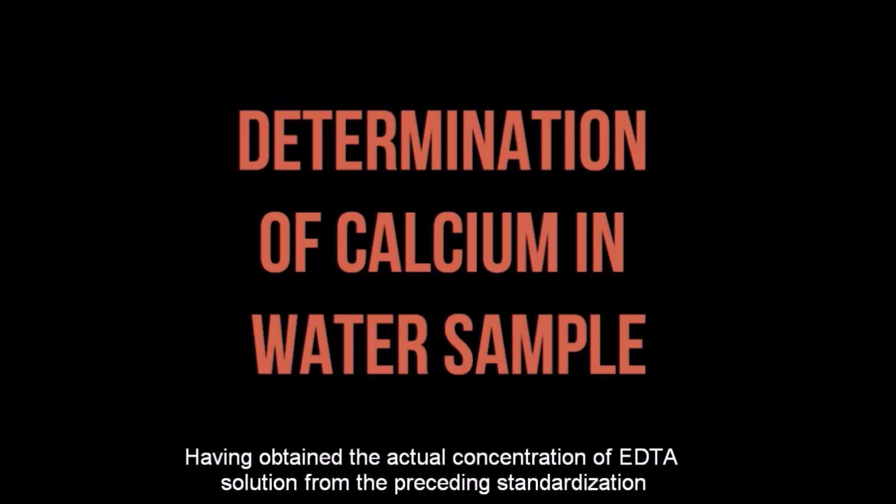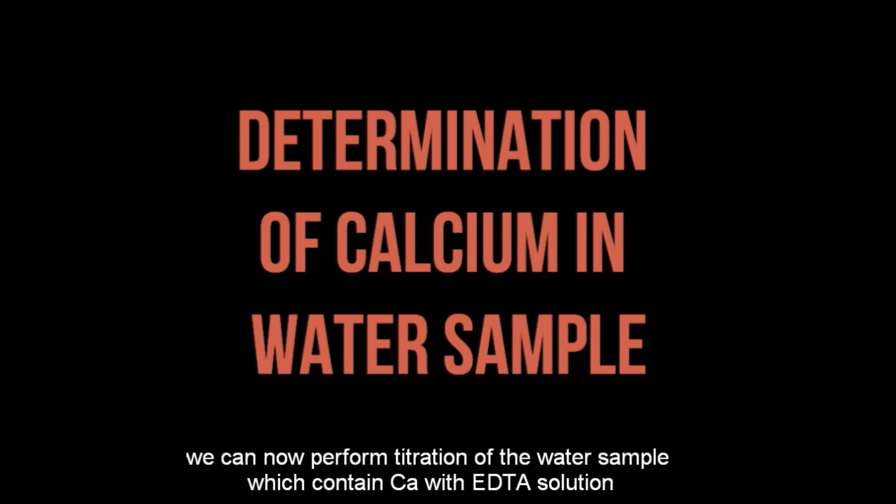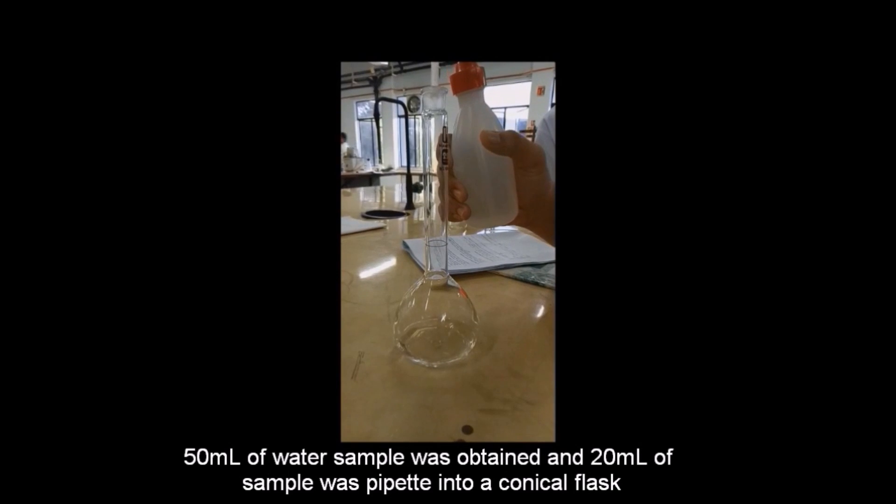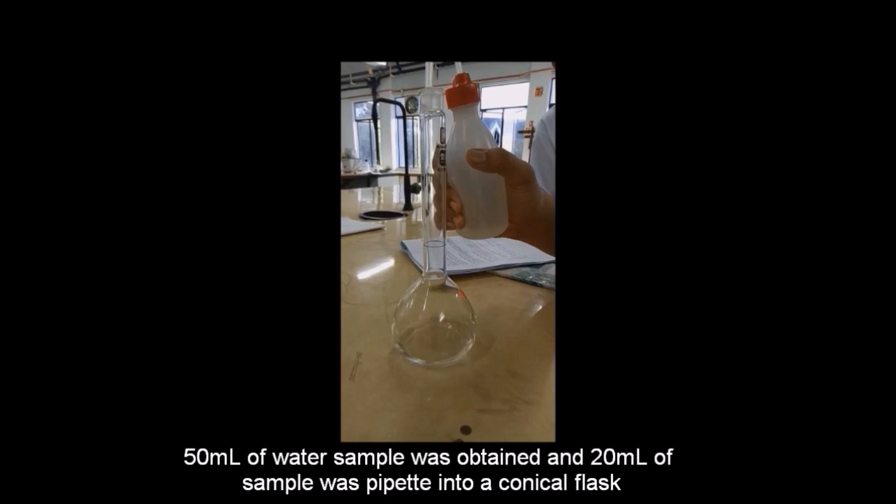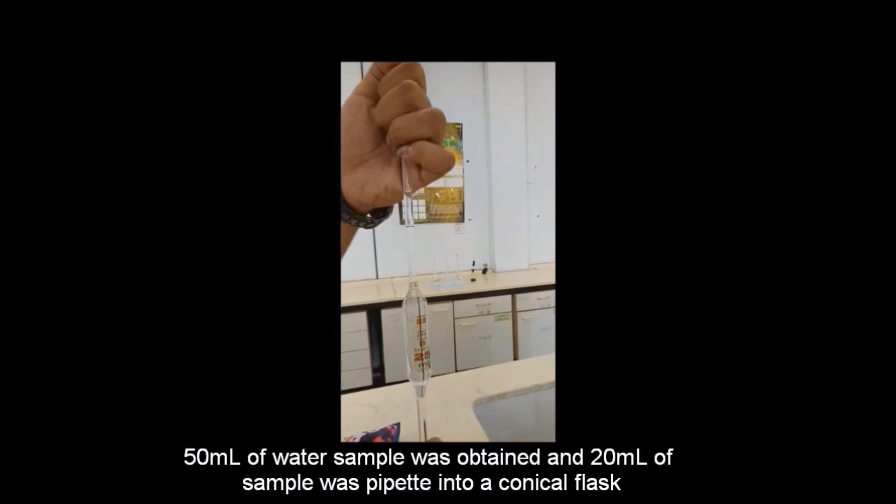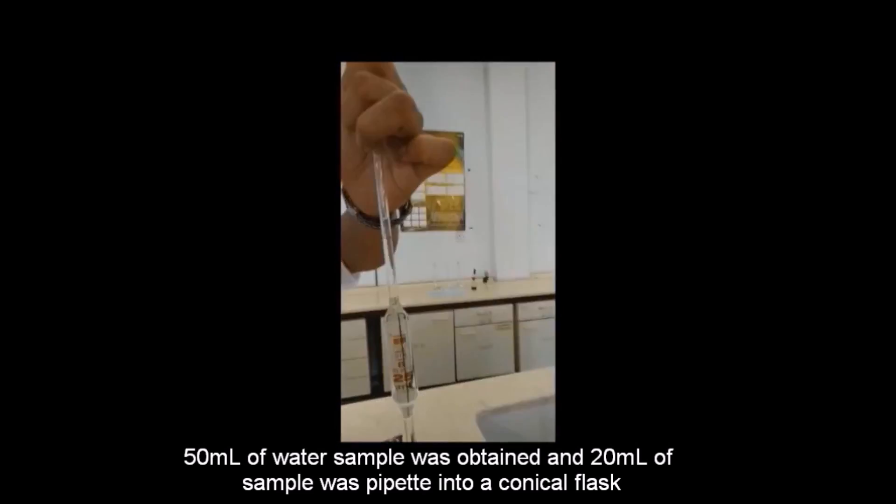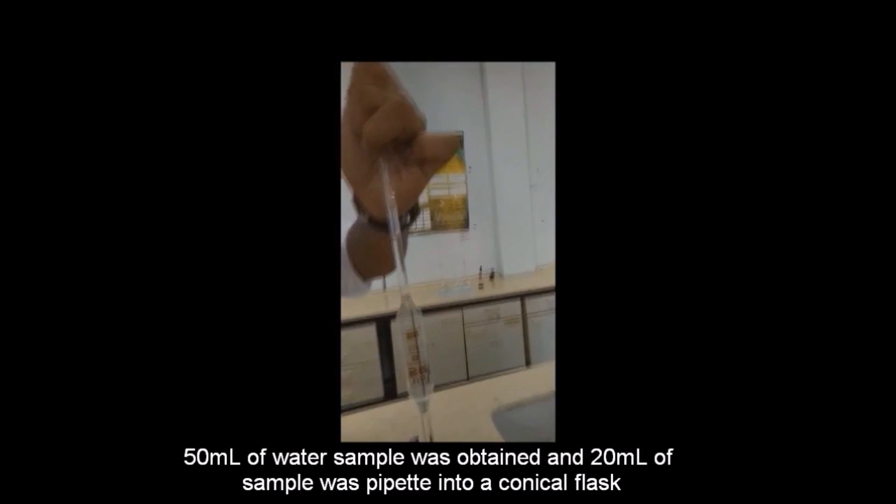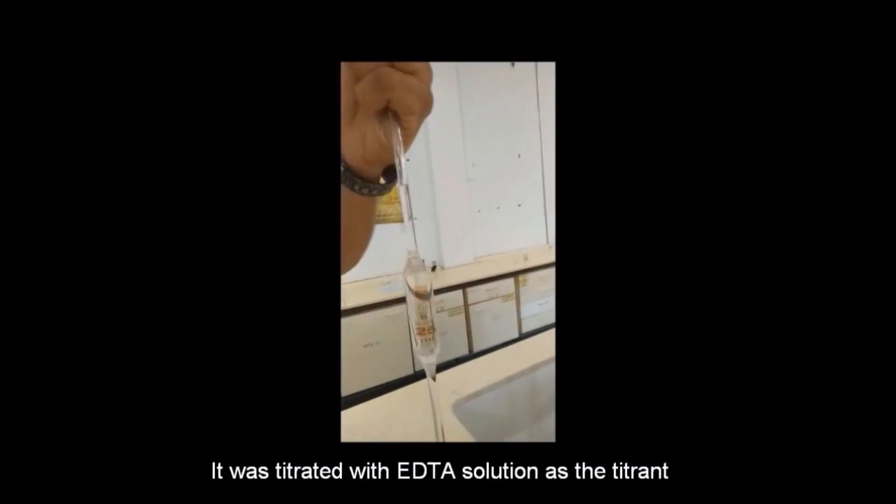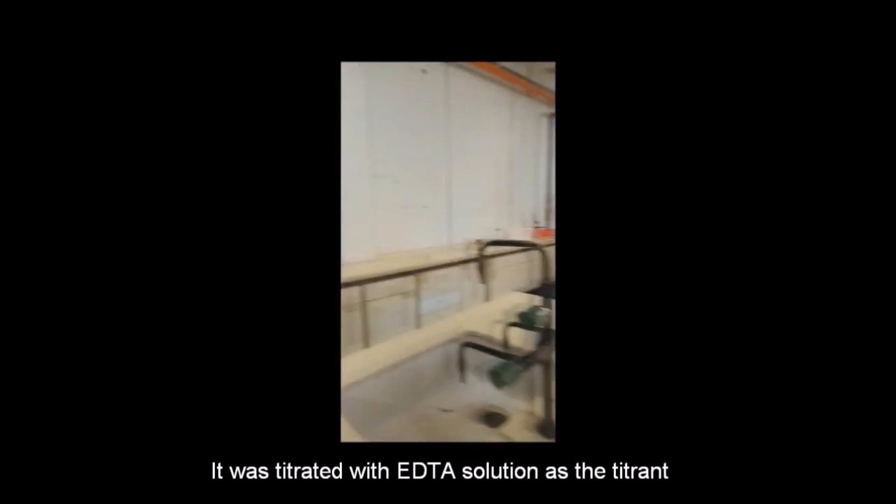Having obtained the actual concentration of EDTA solution from the preceding standardization, we can now perform titration of the water sample which contained calcium with EDTA solution. 50 ml of water sample was obtained and 20 ml of sample was pipetted into a conical flask. It was titrated with EDTA solution as the titrant.